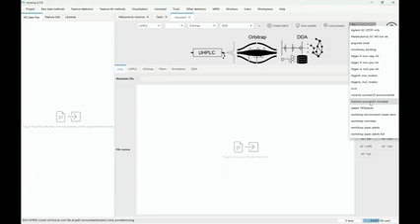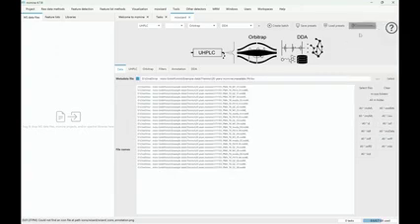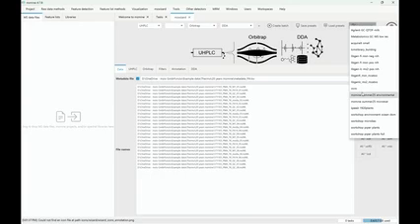And then we're going to set it up together. This is usually also how you're going to share this. There are local presets that you define for your, let's say, 10-minute reverse phase gradient, and for your Q Exactive or timsTOF or whatever instrument. And then later you can mix and match these different methods and configure mzmine quickly.